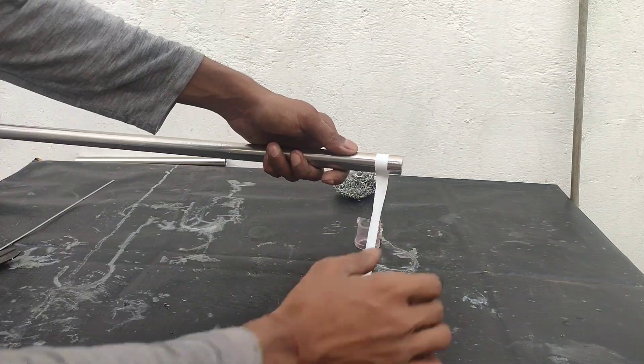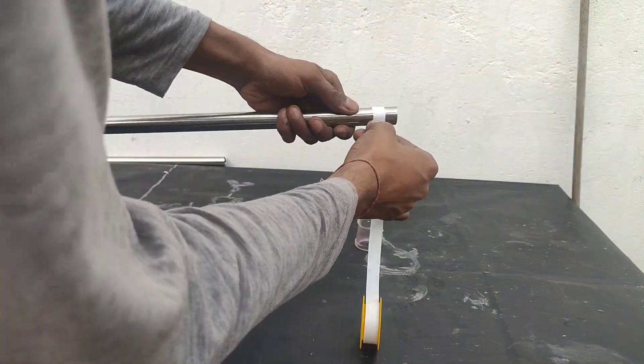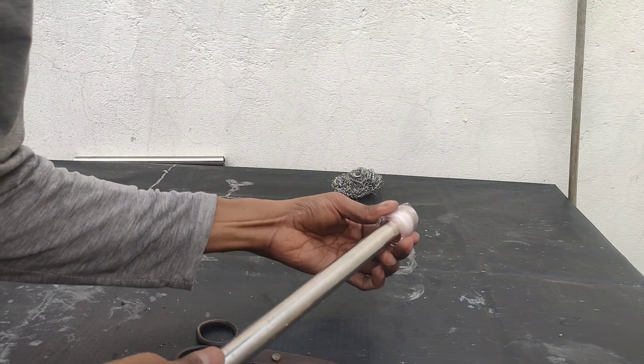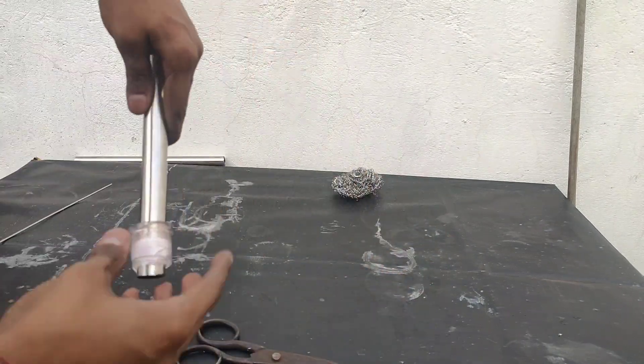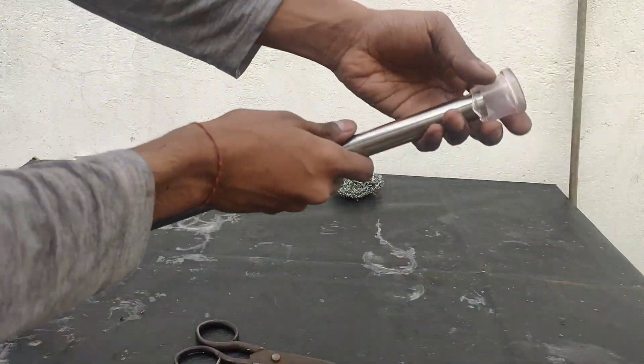Once the column was packed from top to bottom, I wrapped teflon tape at the bottom, leaving some space for the drip tip. I wrapped the tape until it became thick enough to form a tight seal with the B24 socket.